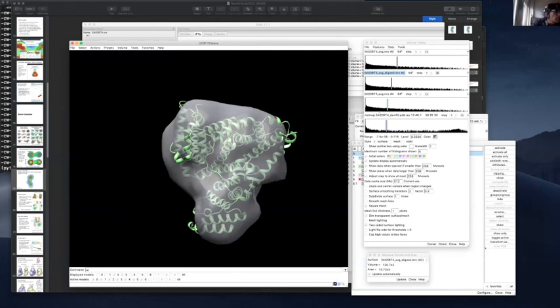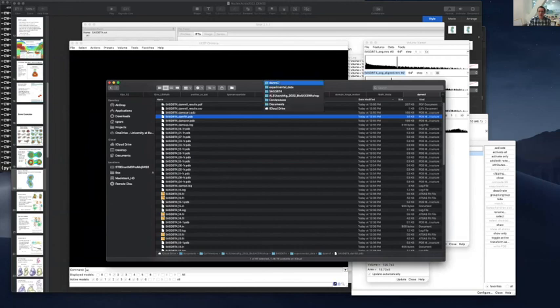What are some fit parameters you pay attention to when you're using DENSS and DAMMIF to assess the quality of the fits? Yeah, that's a good question. So why don't I show this?